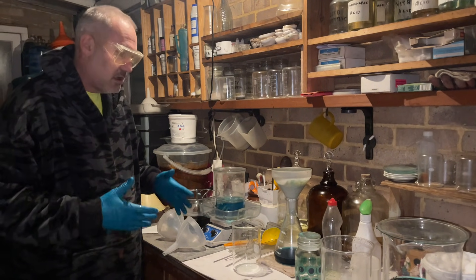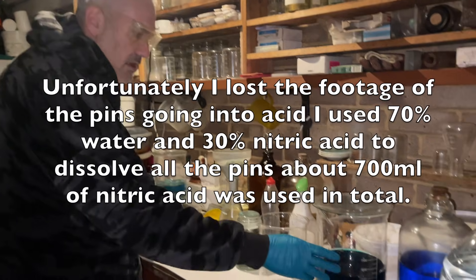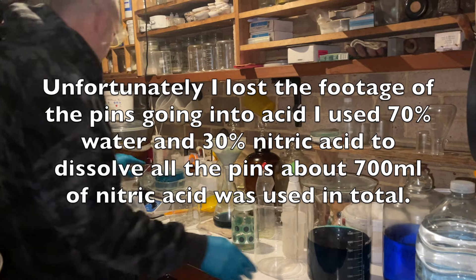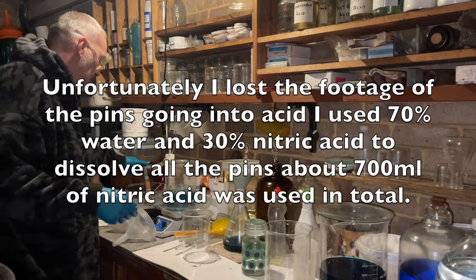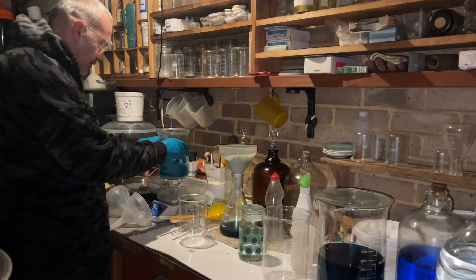I'm doing 600 grams of pins. This is the waste I've got from it. I've checked it for silver — there's no silver in there at all. I'll check by putting a copper bar into it and there's literally nothing coming out, so there's no silver on it. This is what I've got left.